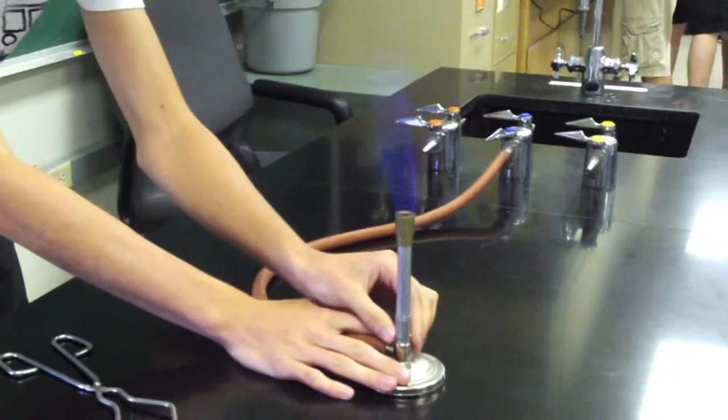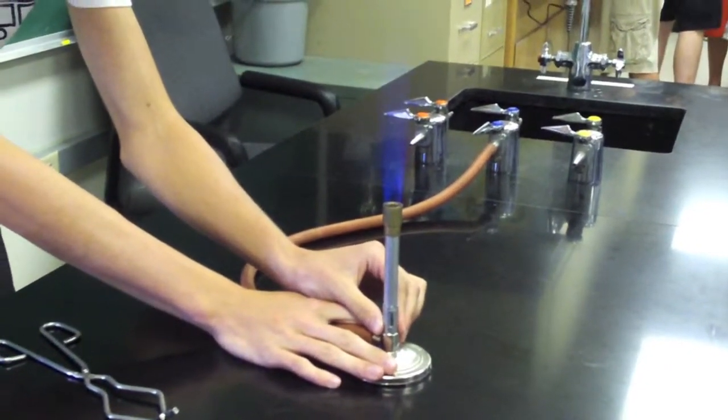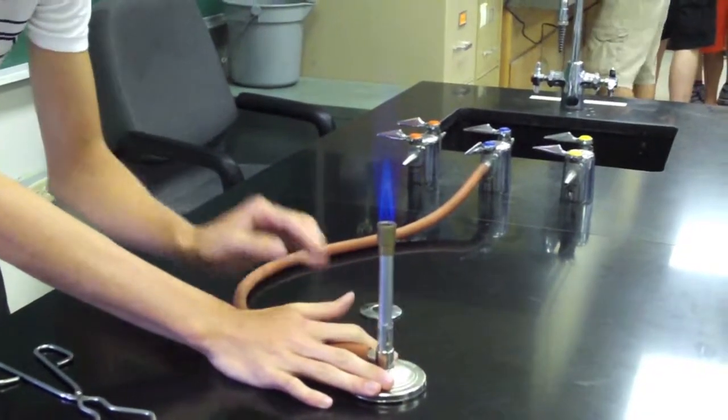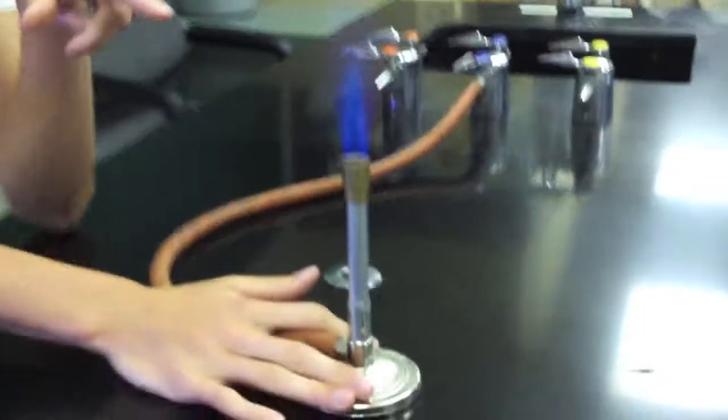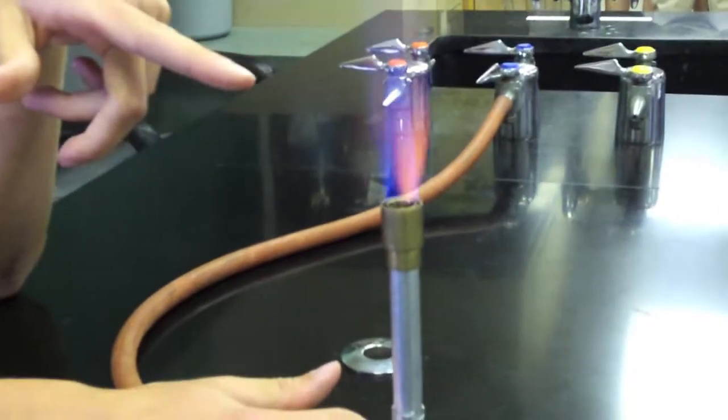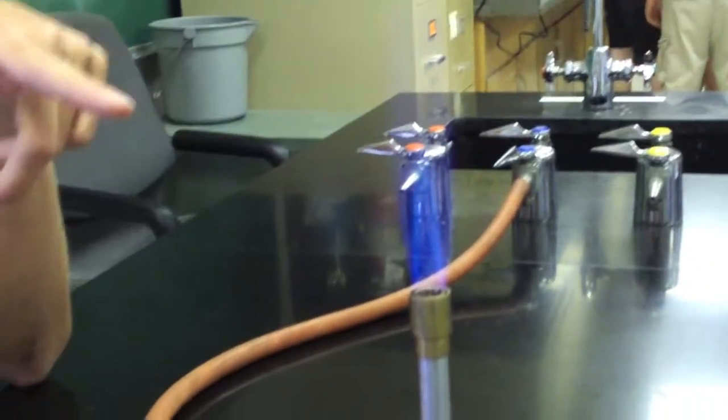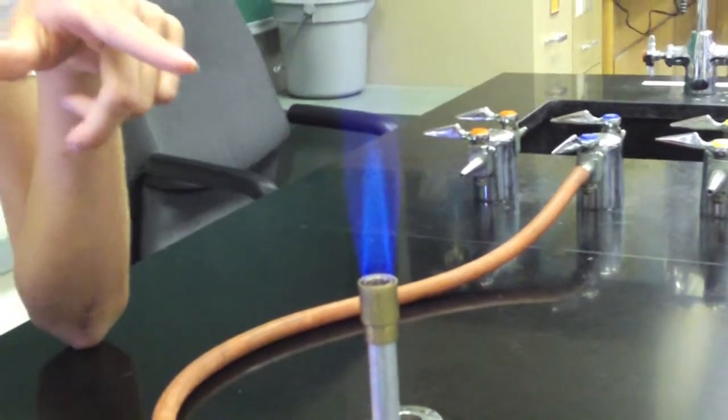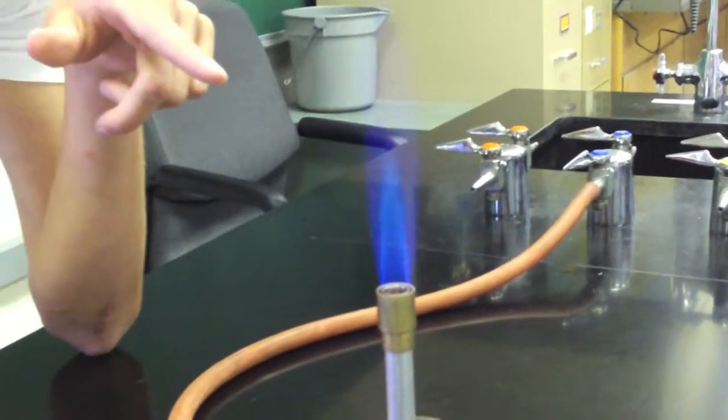Right now, it's a pretty weak flame, but when I start opening the air valves, as more oxygen goes in, you develop this light blue inner cone. This inner cone is going to be the hottest part of the Bunsen burner. So when you're heating something like a crucible, you want to place the bottom of the crucible right above the light blue cone.